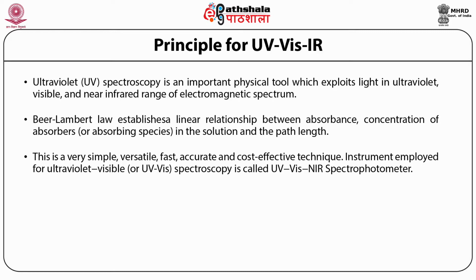The instrument which is employed for ultraviolet visible or UV-vis spectroscopy is called a UV-vis NIR spectrophotometer.